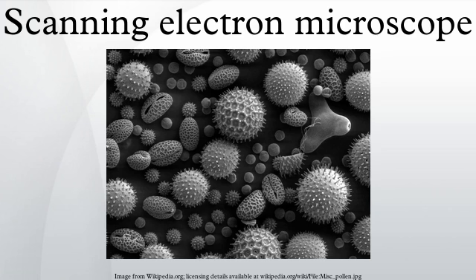Characteristic X-rays are emitted when the electron beam removes an inner shell electron from the sample, causing a higher energy electron to fill the shell and release energy. These characteristic X-rays are used to identify the composition and measure the abundance of elements in the sample.